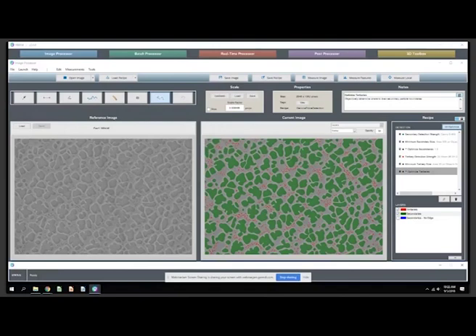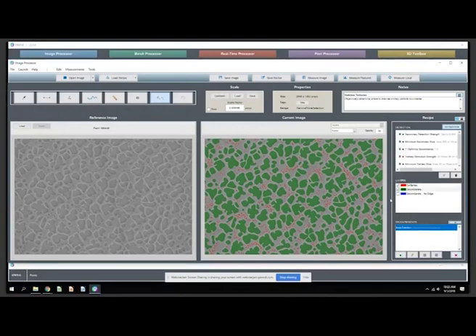So once you have the recipe built, as we did for NASA, we delivered this to them and they began using it same day. Now comes the reason you did this in the first place, which is measurements. So as you saw when the recipe loaded, you can measure simple things like area fraction of all of the layers. These are now, as part of our 2.0 release, completely customizable, and you can assign them to any of the layers or only some of the layers that you have active with this Choose Layers tool.